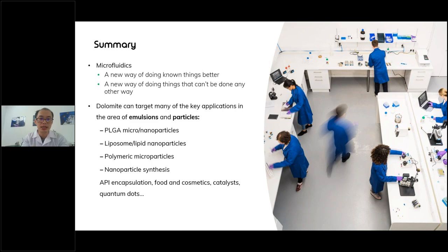A summary. This will summarize all of the content that we have learned in this webinar series. So we learned about microfluidics. It's a new way of doing things, and it's also a new way of doing things that can't be done any other way.